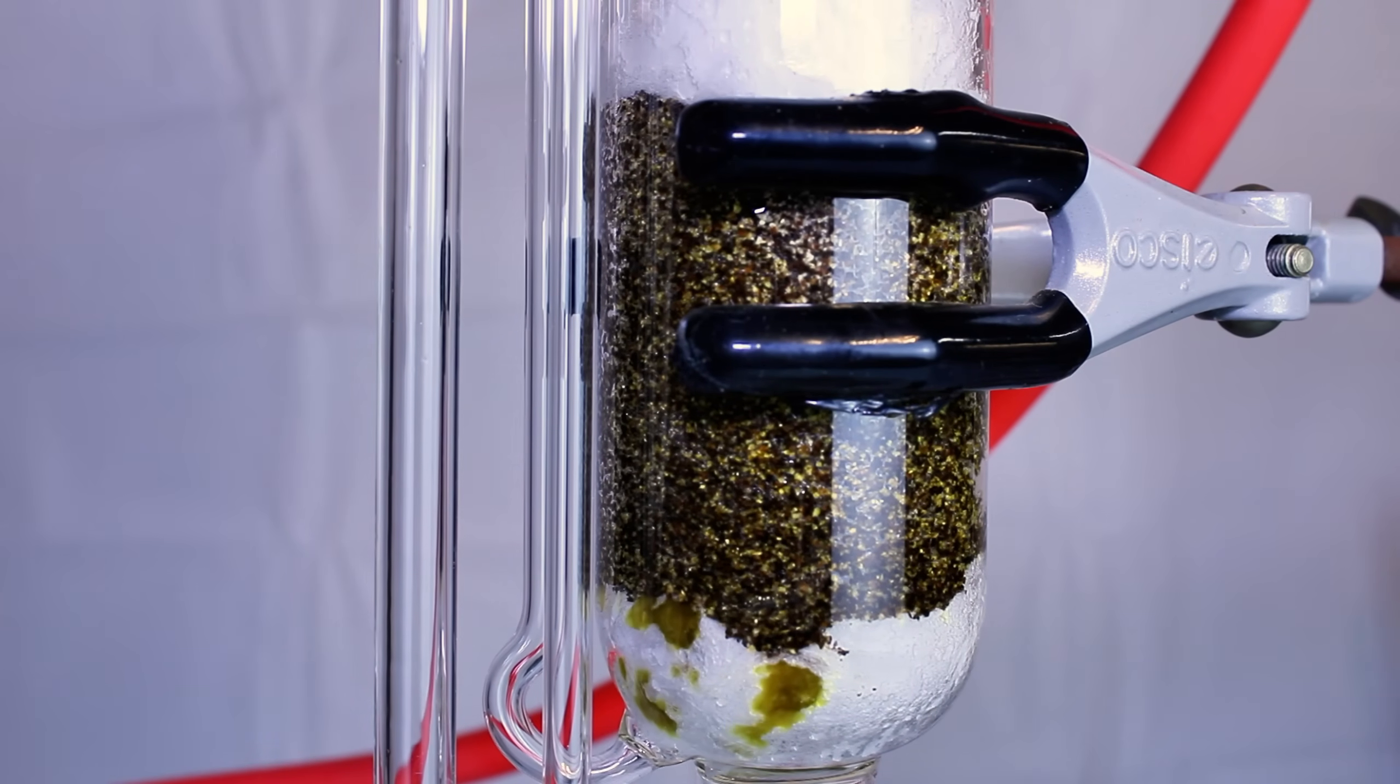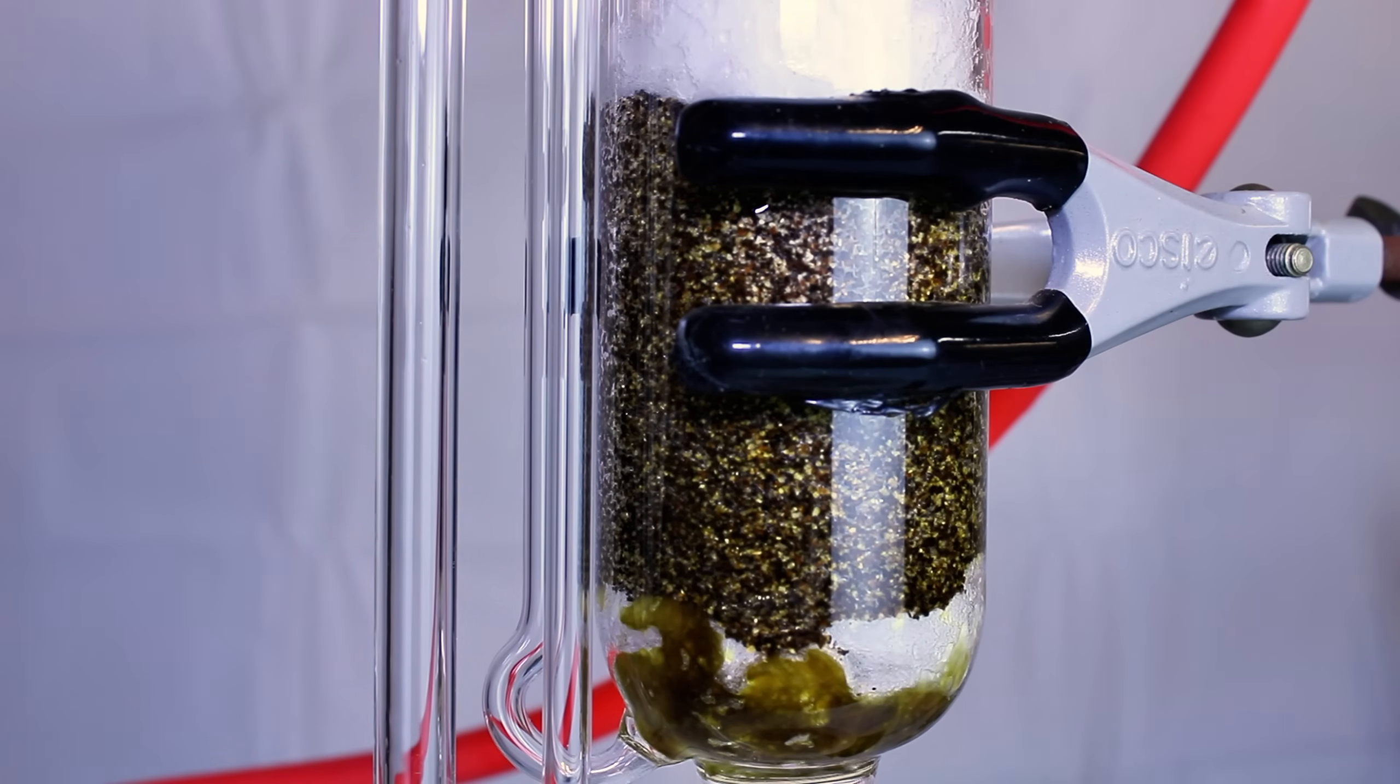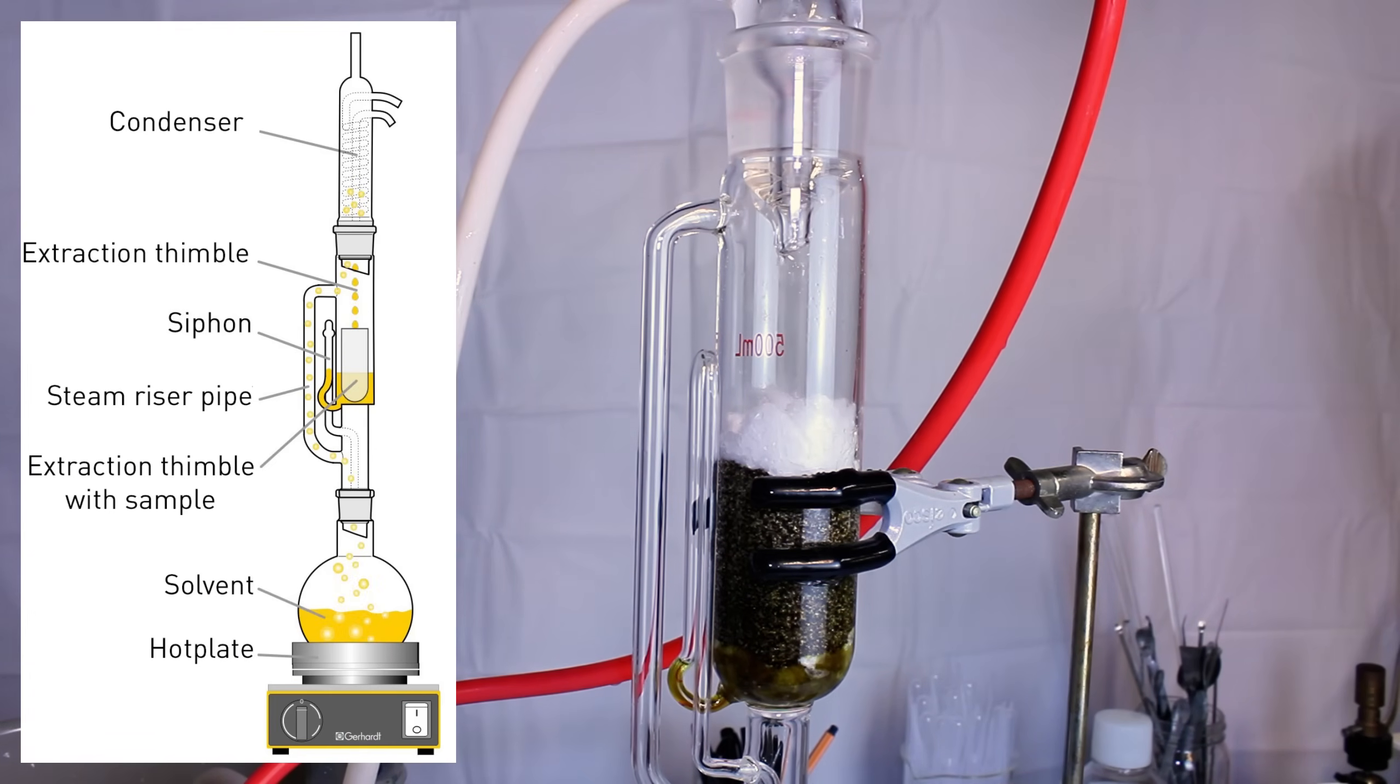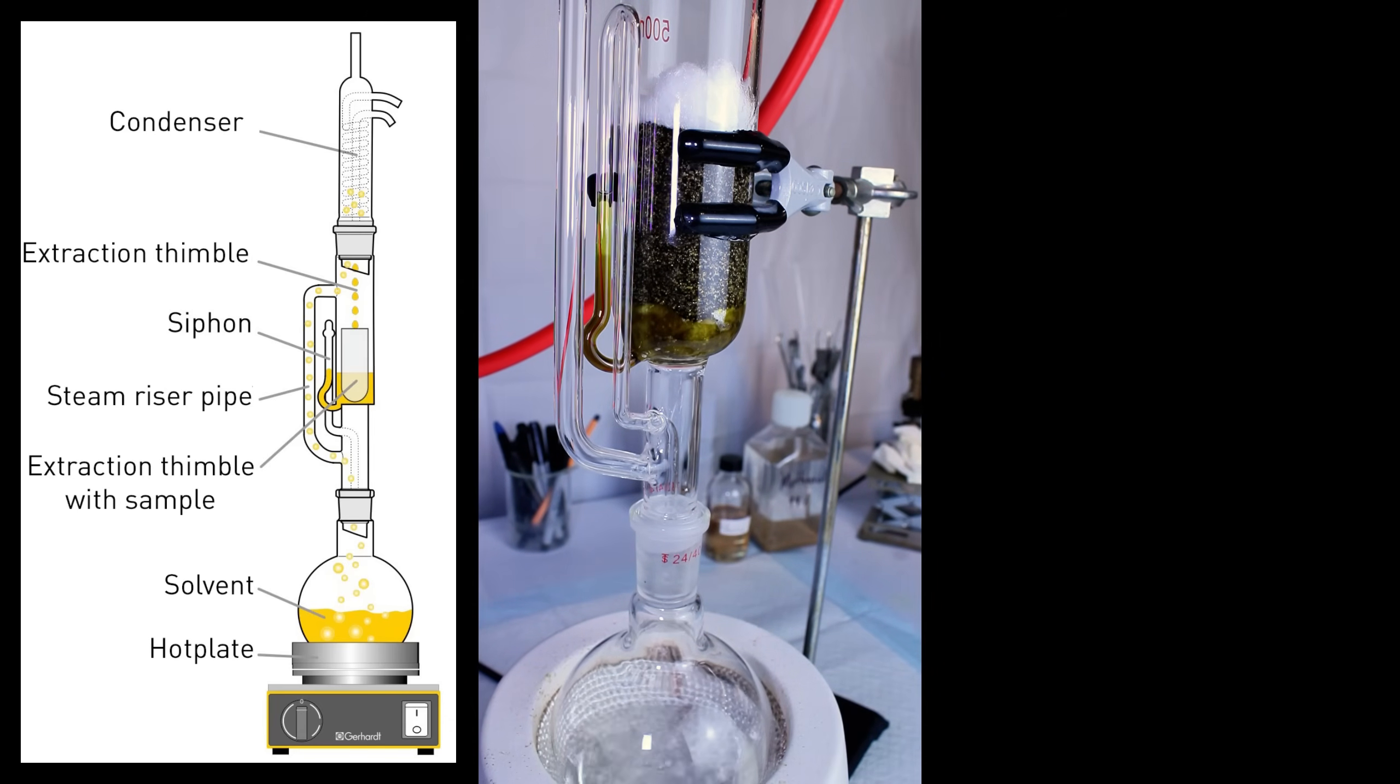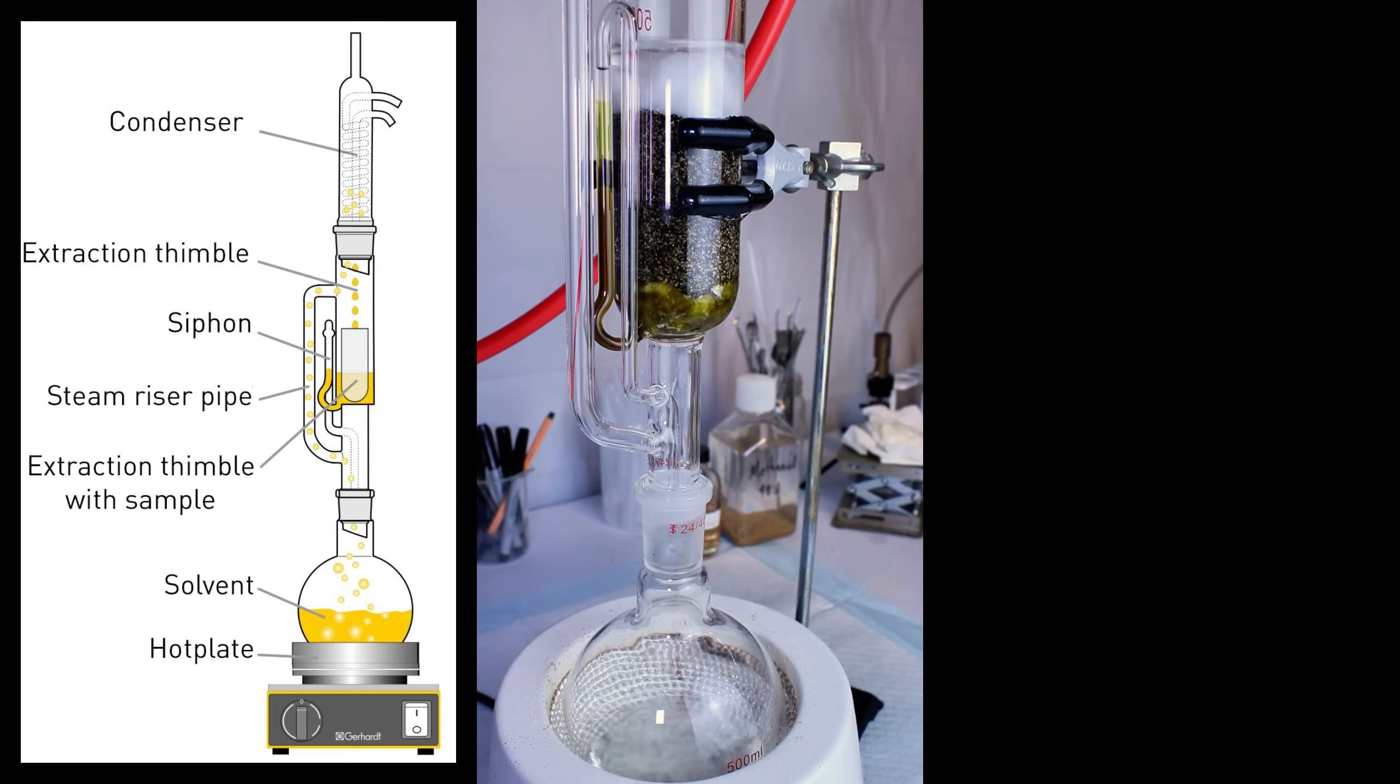As the volume of isopropyl in the Soxhlet Extractor increases, it begins to travel up the secondary siphon arm, and this is where things start to get interesting. Here's a diagram of the Soxhlet Extraction apparatus so you can better understand what I'm talking about. Basically the idea here is that when the solvent rises to the top of the bend in the secondary arm, it'll create a vacuum which will pull all of the isopropyl through the black pepper and back into the boiling flask.